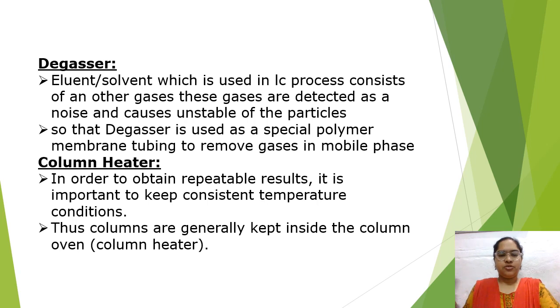So in the above mixture, not only mobile phase and stationary phase, there are also some gases which are unnecessary. So these gases are removed using the degasser. Degasser is a membrane having tubing structure.